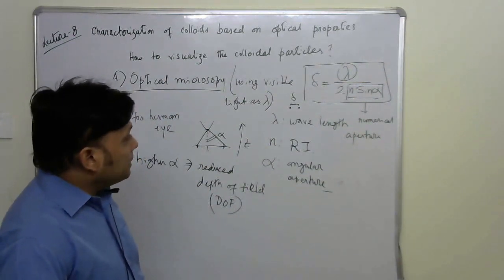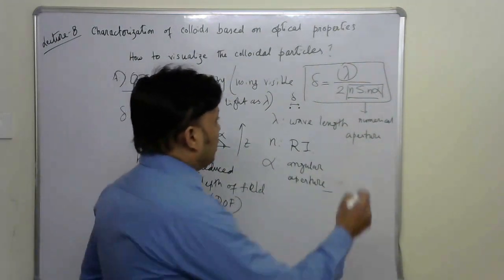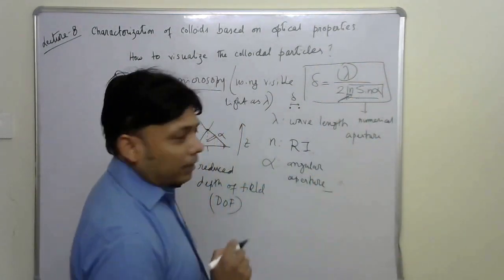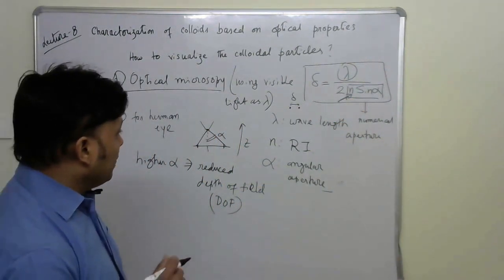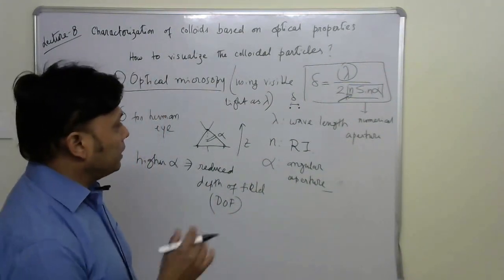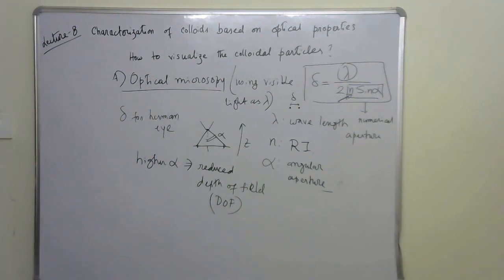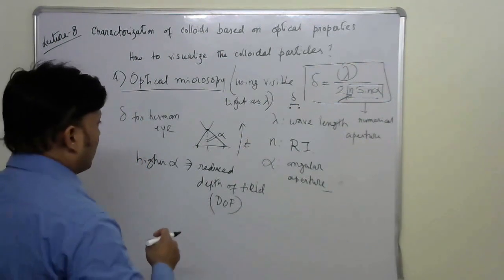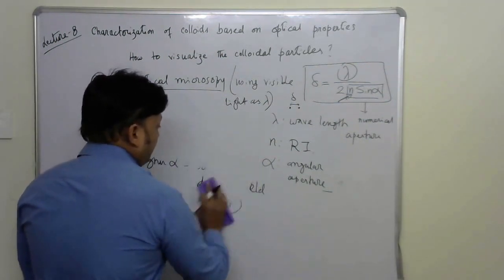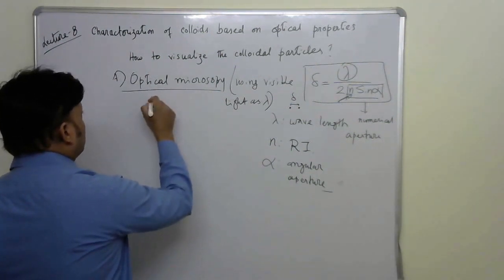All right. But there is still one way to improve the numerical aperture, because here there is the term n. n is the refractive index. So now we can definitely try the microscopy in a medium with an increased refractive index. Can you think about what mediums have an increased refractive index? For example, normal optical microscopy is done in air.